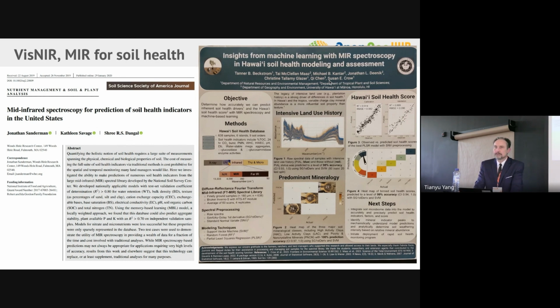Yes, that is the soil spectroscopy. But in reality, soil science is also complex. You know, we do want to simplify everything. Everything you can make simple. But some things are complex, and some things you don't correlate, it doesn't work in soil spectroscopy. Whoever tries to sell you that, you can check our paper, we can show you. We tested all these things. We don't have to sell anything. You know, SSL is open source. We don't sell anything. We don't have to hide the negative results. We show everything, and so some small variables are difficult with soil spectroscopy, even with MIR.